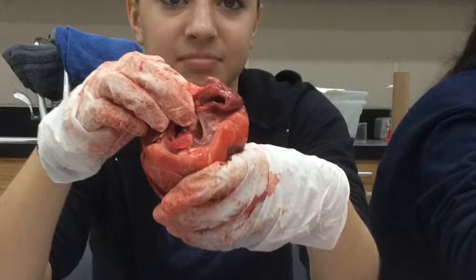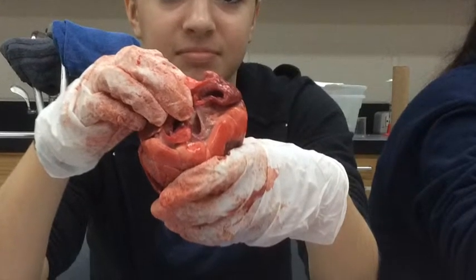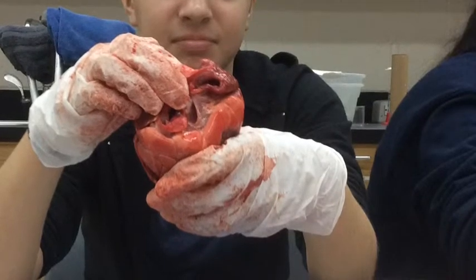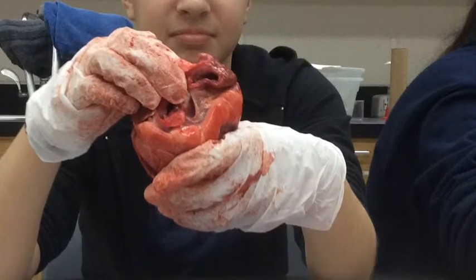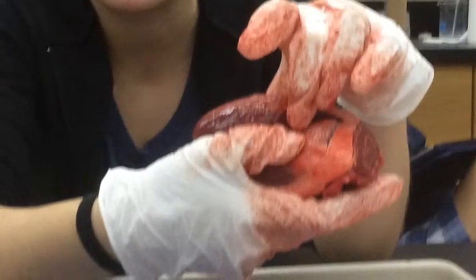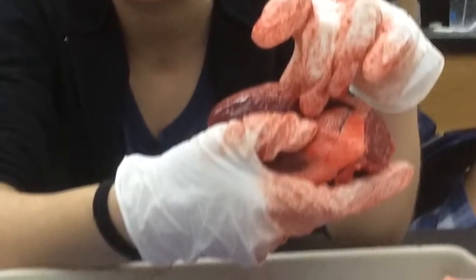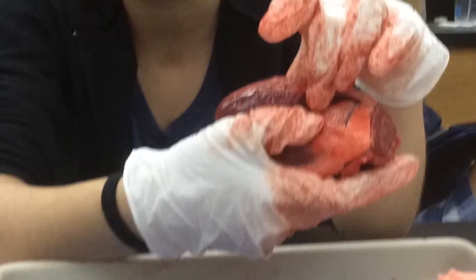Here are the aortic valves. These are shaped in a circular form, and their function is to close while the mitral valve opens to allow blood to flow from the left atrium into the left ventricle. Here is the thick layer of muscle between the ventricles — it's the septum, and its function is to separate the left side of the heart from the right.